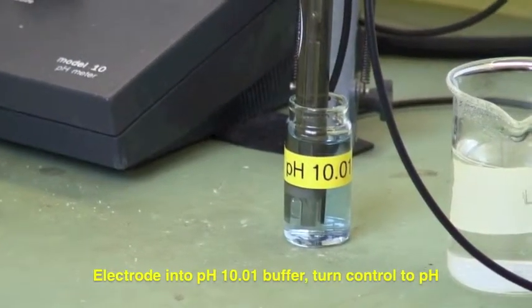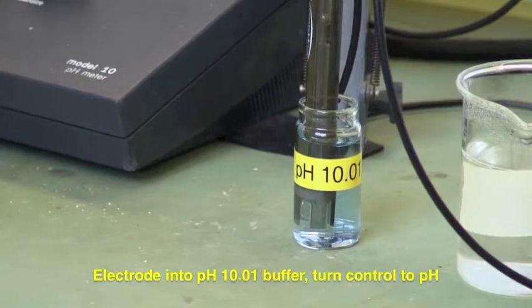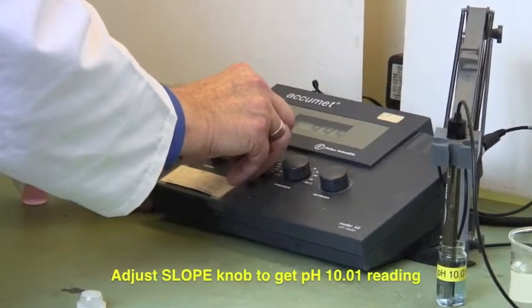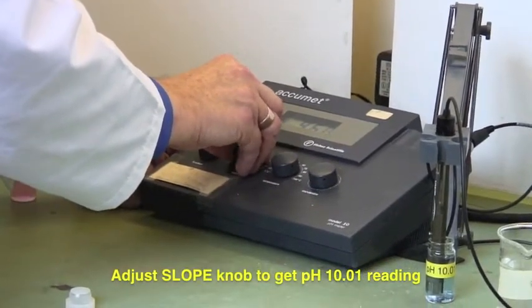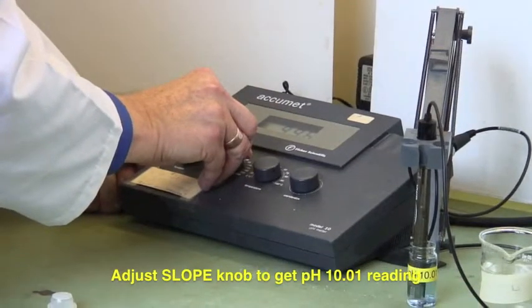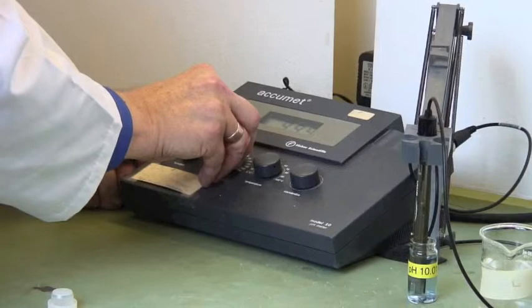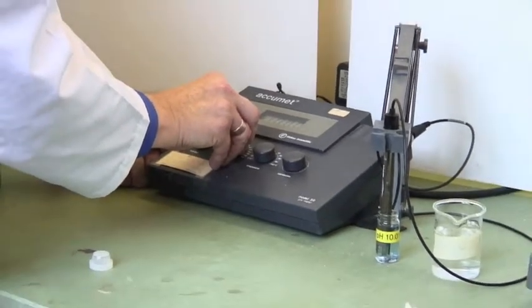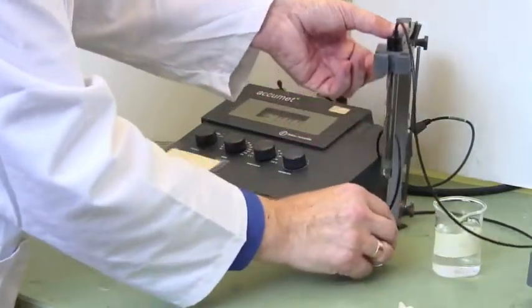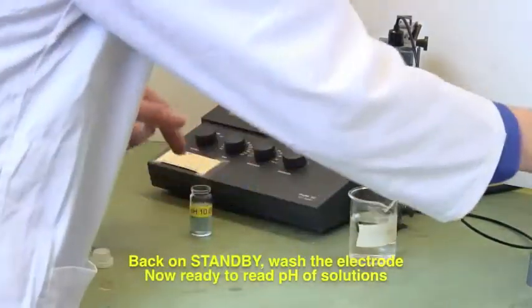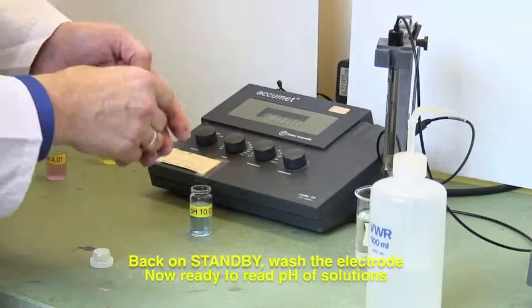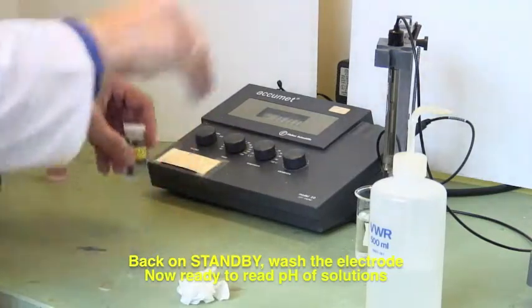Put it on pH mode. Instead of using standardize, use the slope knob to adjust the reading to 10.01. Once adjusted, put it on standby, lift it up, and wash the electrode. You're now ready to take pH measurements.